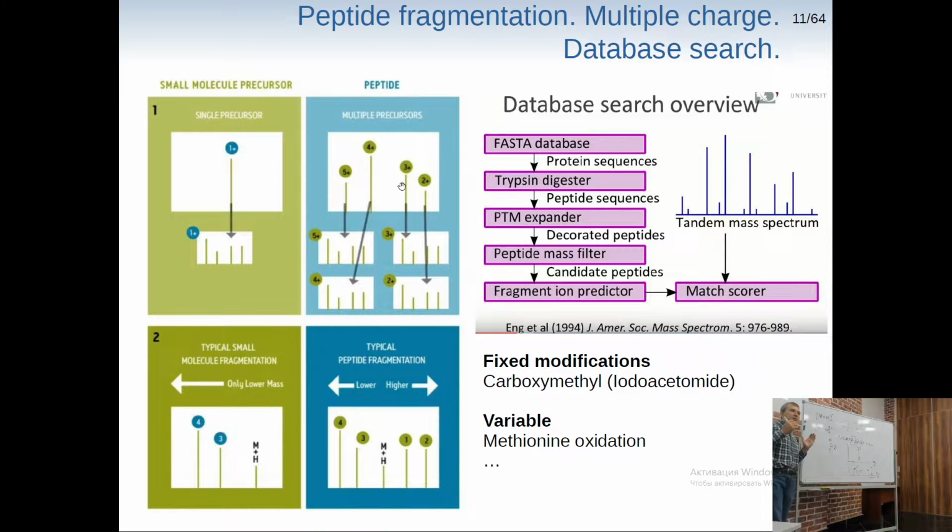So, in reality, fragments of your ion can seem bigger just because they have lesser charge, right? And actually, that's what we want in proteomics. We want to use for search only species with 2 or 3+ charge. It will be more efficient for search. We'll have more fragments. It will be easier to do. Are there any questions concerning databases and how they get searched for proteomics?